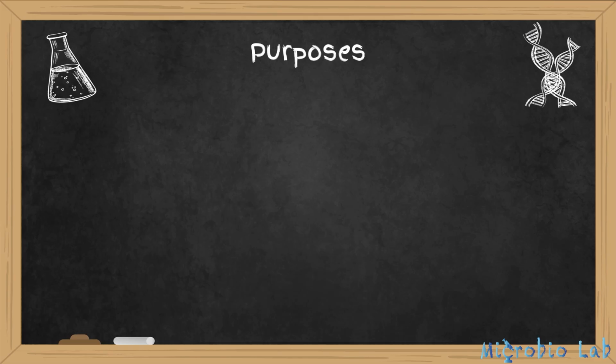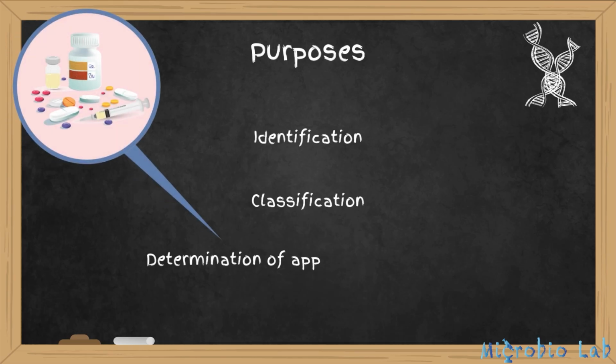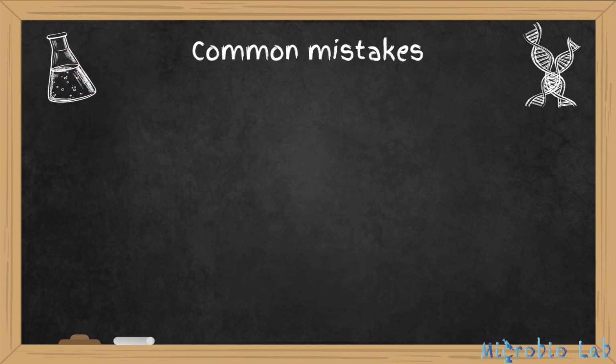This differentiation is crucial for the identification, classification, and determination of appropriate antibiotic treatments for bacterial infections. Let's discuss some common mistakes that might alter your results and how to avoid them.